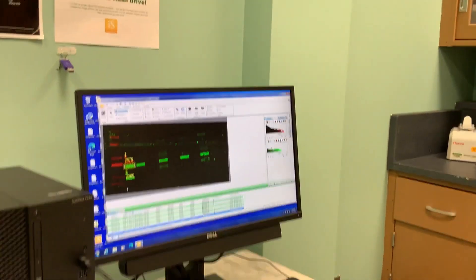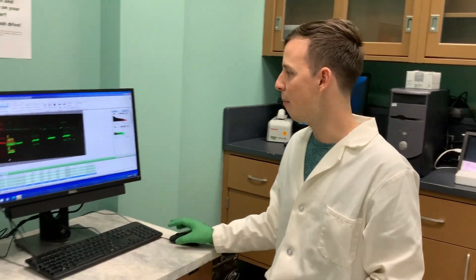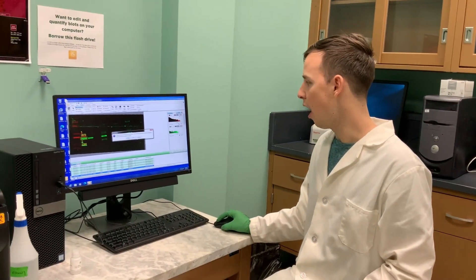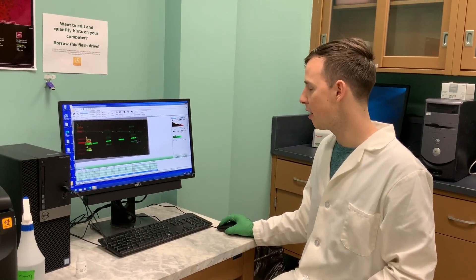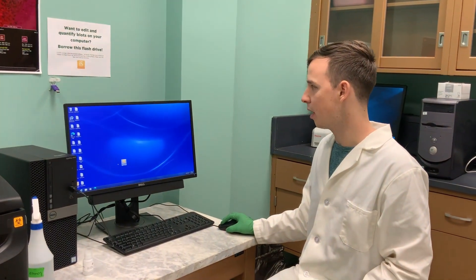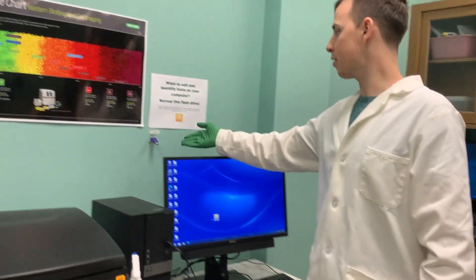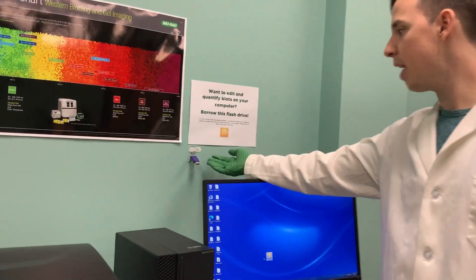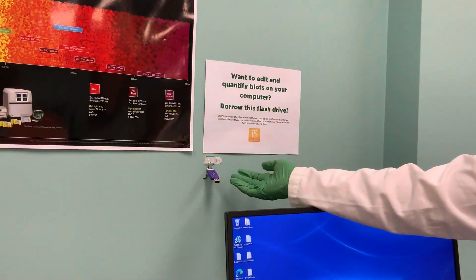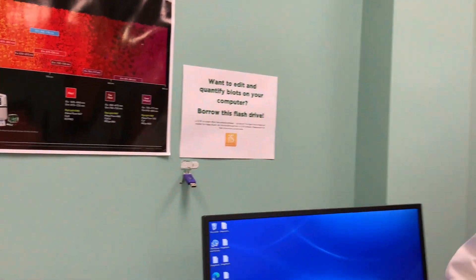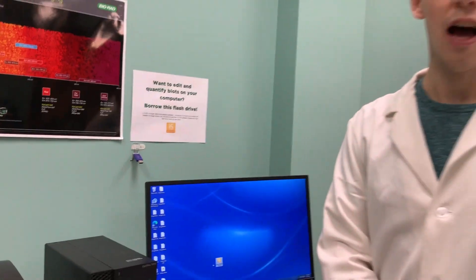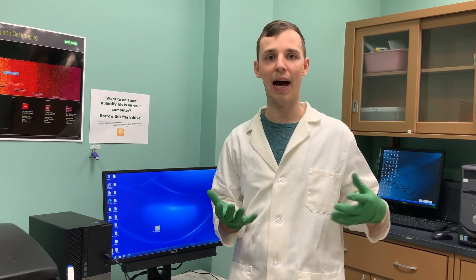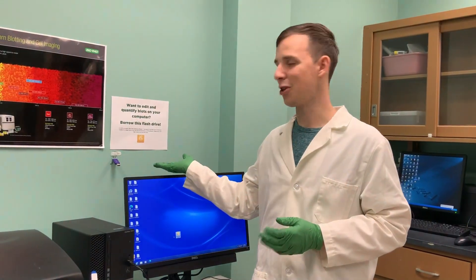You save everything and you can close. I'll note that this flash drive we have around has the installer for Image Studio Lite. Image Studio Lite is not offered anymore by LI-COR, but we still have the installer available for you so you can install it on your computer. That's the free software that allows you to edit your blots later on your own personal computer instead of having to come back to the floor. Please make sure to return the flash drive when you're done and leave the area clean.